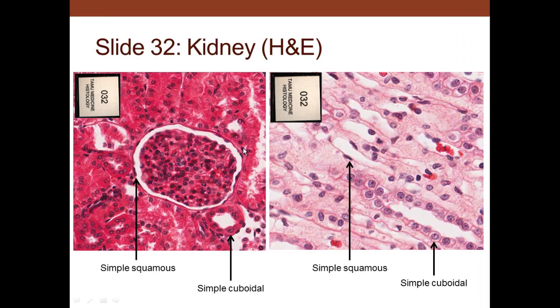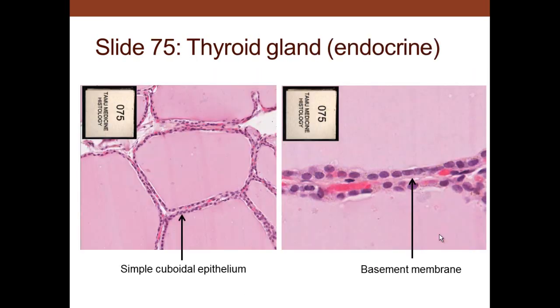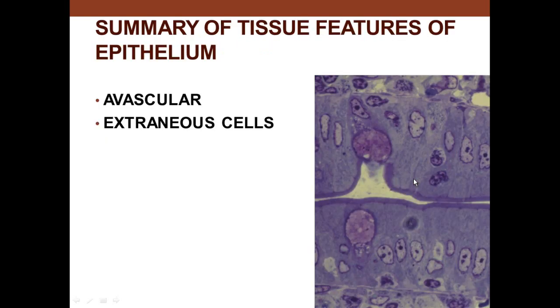In the kidney, we can see a host of different cell types. Cells that are cubed and one layer are simple cuboidal; cells that are flattened are simple squamous. The renal corpuscle has simple squamous parietal epithelium, there's simple squamous in the blood vessel, and simple cuboidal in the nephron. Simple cuboidal cells are also found in the thyroid — the follicular cells surrounding thyroid follicles are simple cuboidal, one layer of cube-shaped cells with a basement membrane.